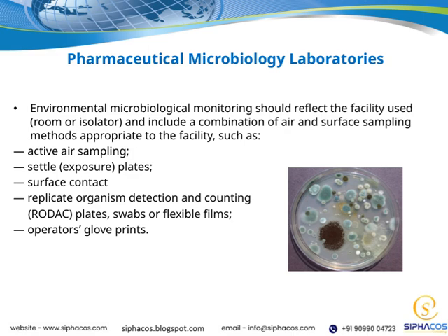They allow particles to settle naturally onto a growth medium over time, giving us a snapshot of airborne contamination. Surface sampling is equally important, and we often use contact plates, swabs, or flexible films to detect microbial presence on surfaces.